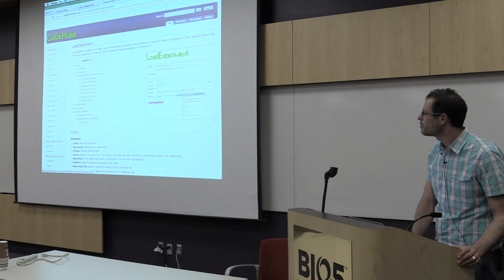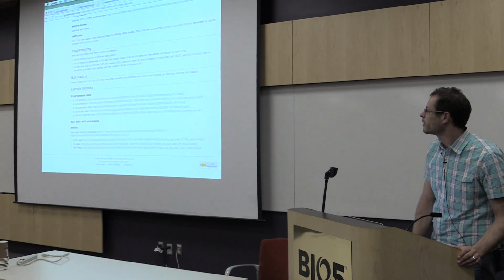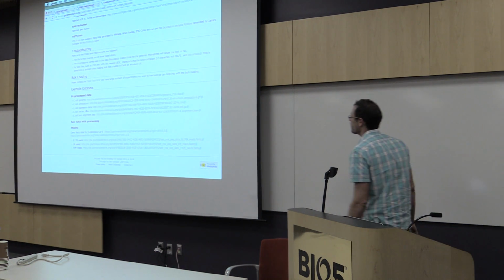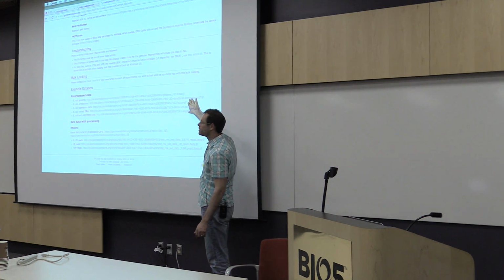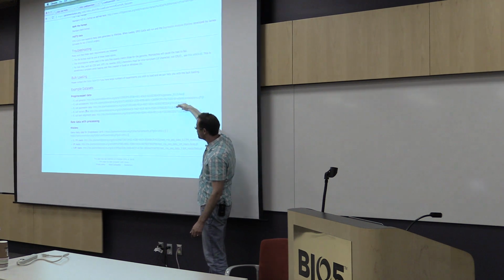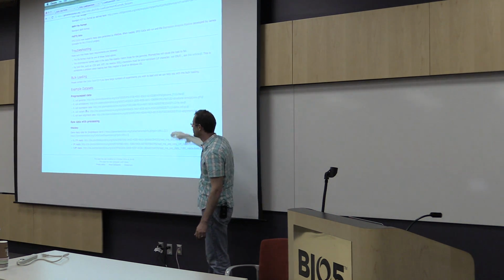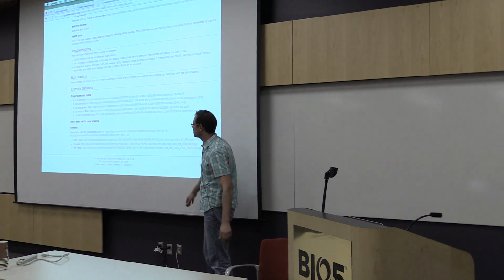And so down here at the bottom are some example data sets. If you follow this link, we have some pre-processed data that you could add in there if you really wanted to get into the system. A genome, some structural annotations, expression data, variant data, and then the BAM file. But today, again, abbreviated, focusing in on RNA-seq.